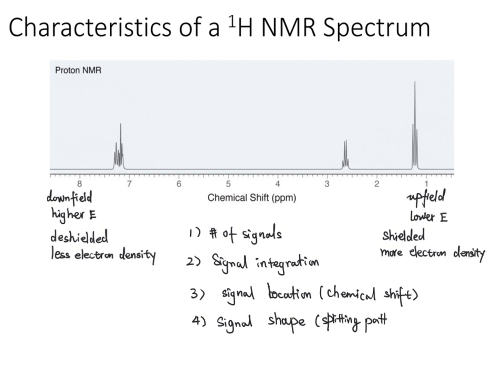Looking at this proton NMR spectrum, we see this signal here, this signal right here, and this messy peak right here, showing you there are different protons, so a different number of signals. Under the signals, and this is different from IR, where the signal goes down, while proton NMR signal goes up, the integration will also tell us information about the protons.